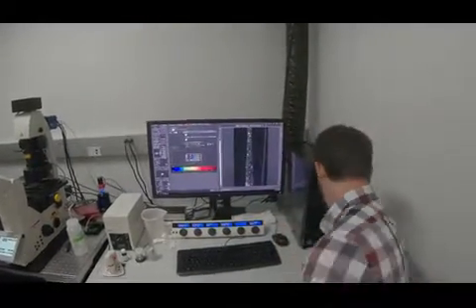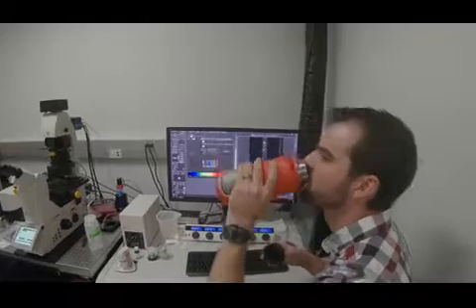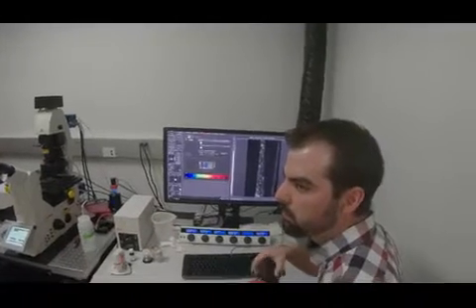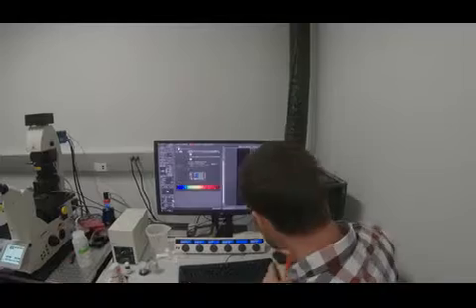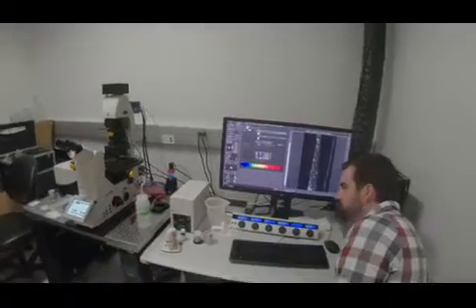Any questions right now? I had a question about moving on to your next sample. How much of the wizard do you have to go through again? If you have to lift up that arm, move that sample out, put the next one in, and then put that arm back, you have to go through that whole wizard again.